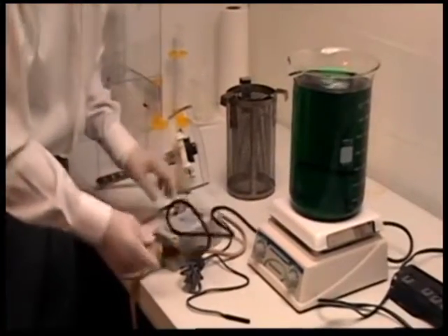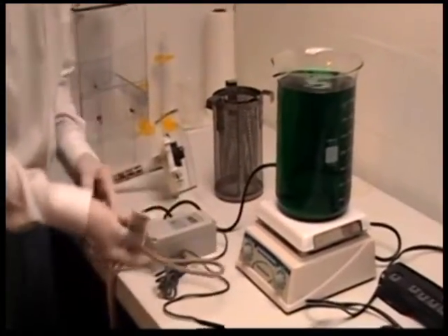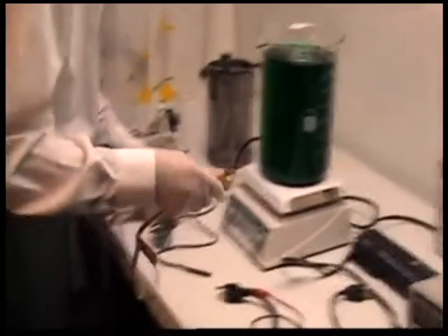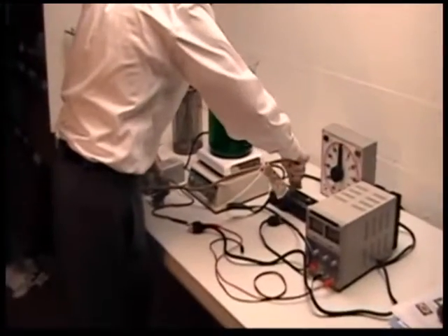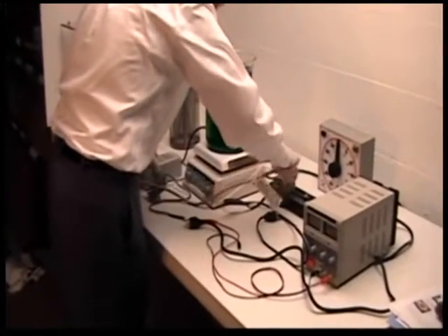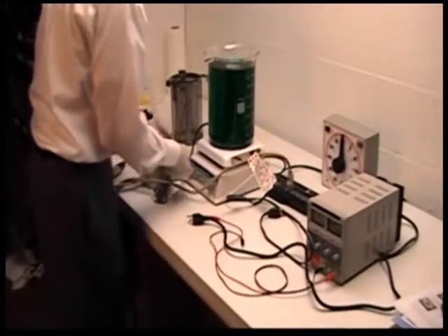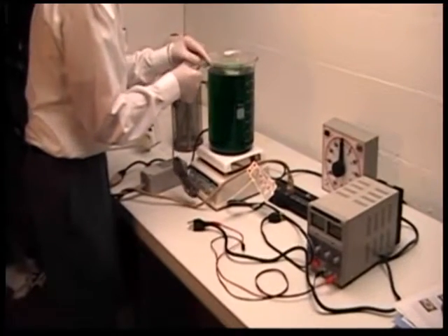The temperature controller will control the temperature of the bath so that it doesn't exceed the desired plating temperature. The temperature controller long lead will be plugged into the current. The probe for the temperature controller will be placed in the plating solution.